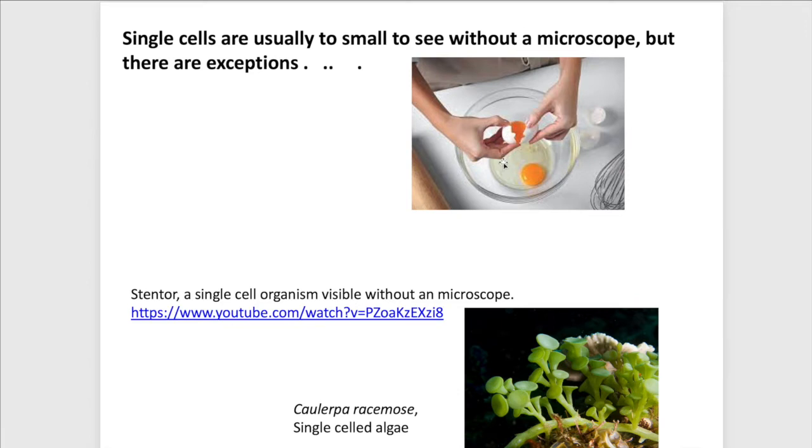And so, of course, people have been looking at eggs forever here. But nobody realized that this was an actual cell here because, why would you? It's just an egg. But be aware, whenever you see an egg, it is a cell. I can see it clearly with the unaided eye here.